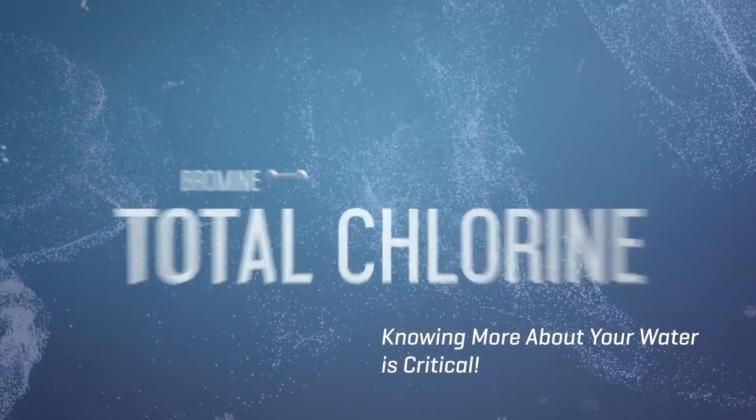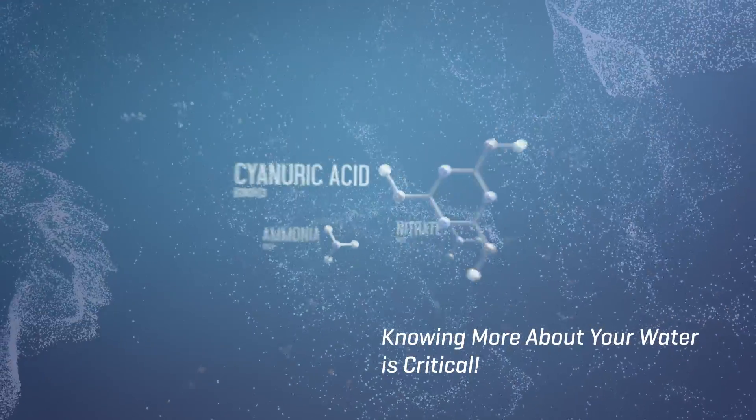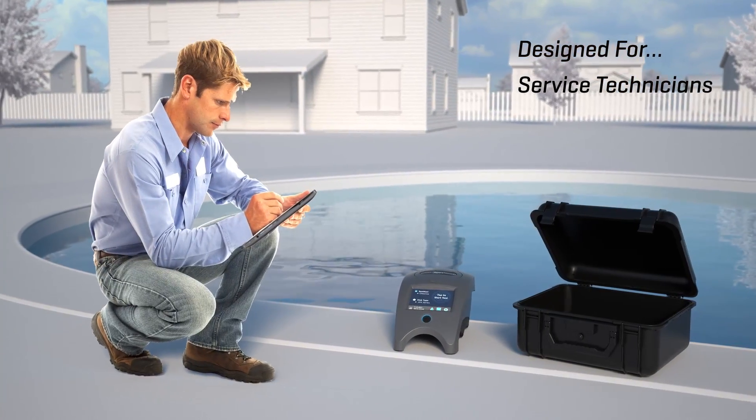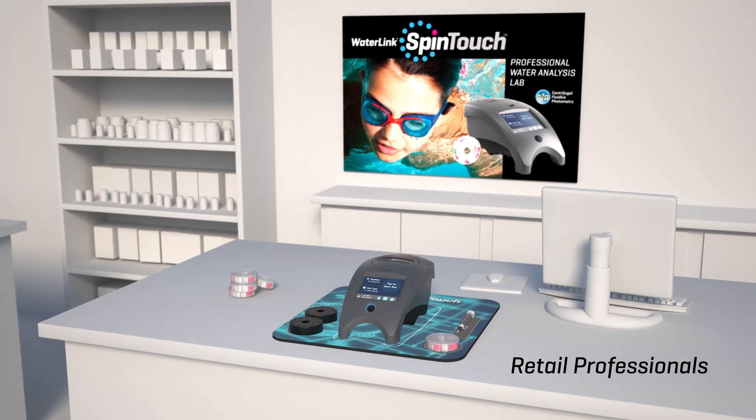The Spin Touch can precisely measure more than 16 critical chemistries. Regardless of the application, the Spin Touch is perfect for all pool professionals, making your job simpler and more reliable.